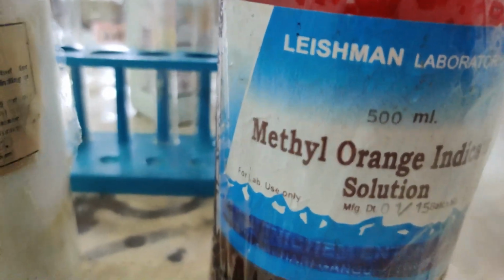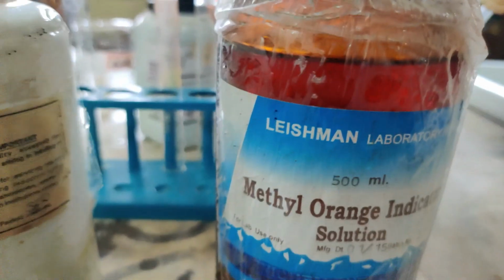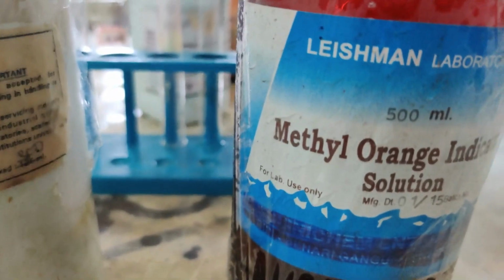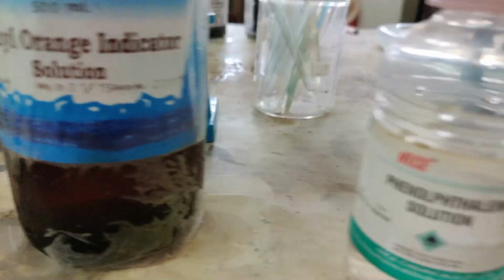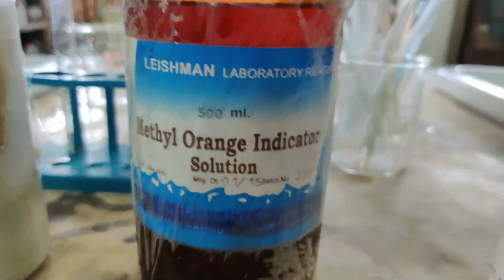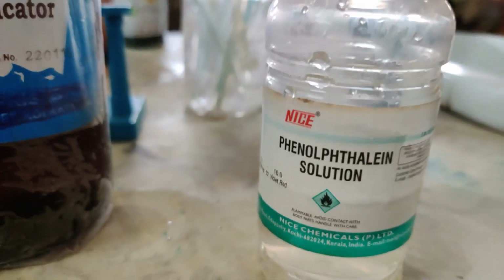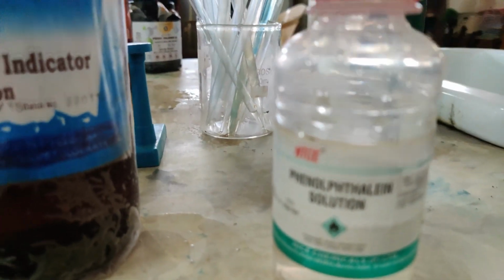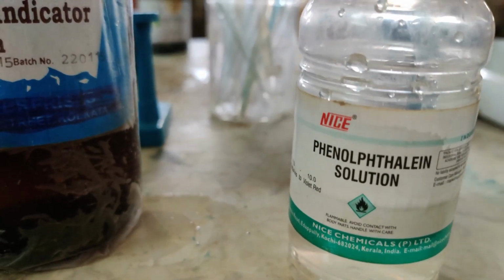Methyl orange will change into two different colors. Since it is orange in color, this orange color will turn either to yellow or to pink. Methyl orange will turn pink if it is acid, and it will turn yellow if it is base. I am going to show you now. Methyl orange is that color. Next, phenolphthalein, as it is colorless, will remain colorless if it is acidic. But if it is basic, then phenolphthalein will turn pink.